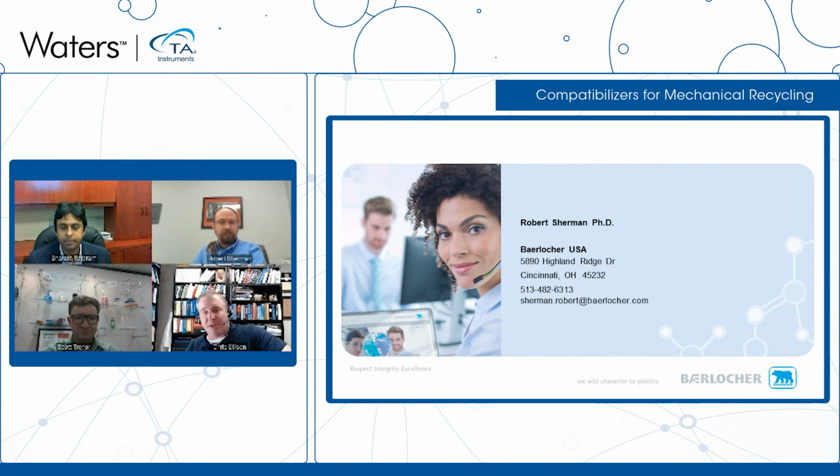Absolutely. The multi-blocks are a little bit more challenging because you have two components present at roughly 50% each, and they're not soluble in many common solvents. So SEC is not that useful for the multi-block, which is why we lean hard on the NMR to do a careful end-group analysis. Of course, there's a distribution in those materials because we couple them by traditional step-growth type coupling reactions, so the total chain lengths have a distribution as well. I hope that answers it. There's no one silver bullet in characterization there. You have to piece together a number of different techniques to develop the picture.